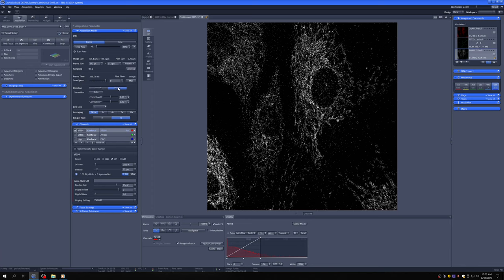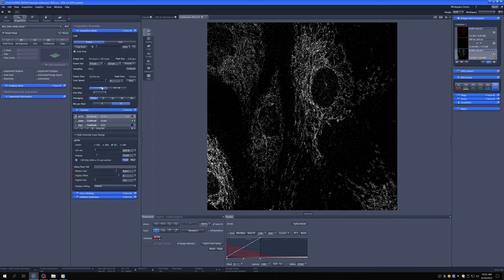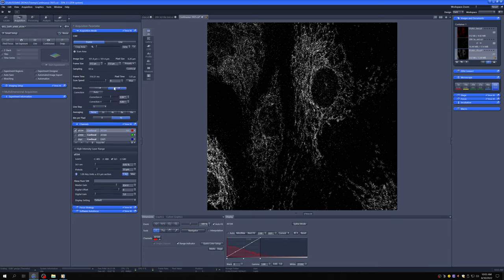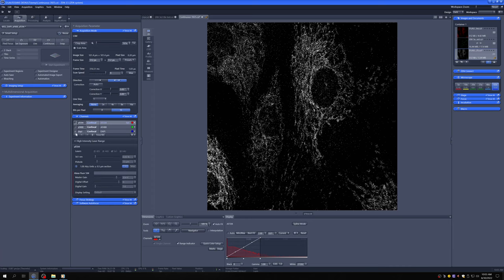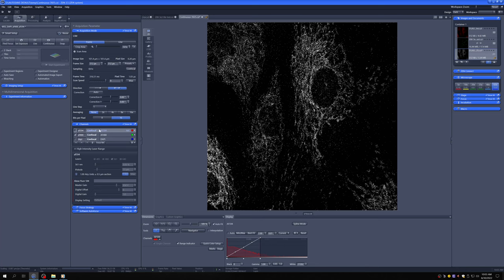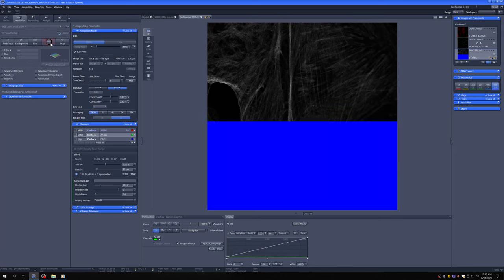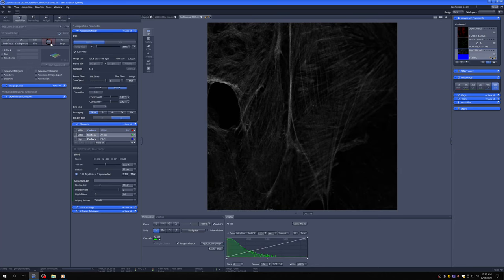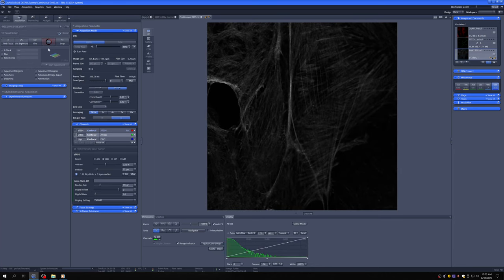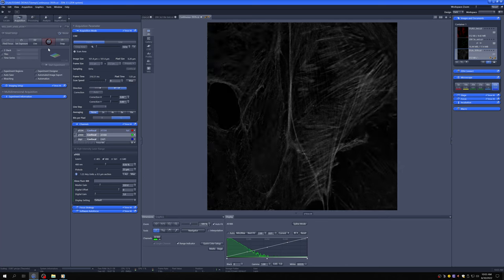With bi-directional, the frame time is 316 milliseconds, with unidirectional 633 milliseconds. So this makes it seem like we should always use bi-directional. And that's actually usually the case. The only caveat here is when you use bi-directional, you want to make sure that there are no artifacts in the image. Let me show you, let's check this with the Alexa Fluor 488. If we go to continuous and we're on bi-directional mode, let me first make sure I'm nicely in focus.